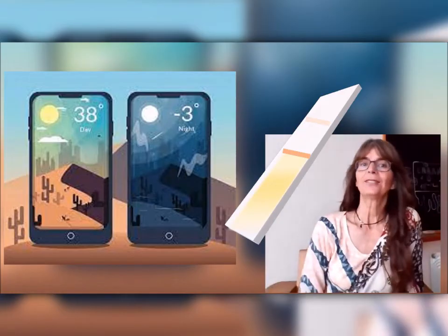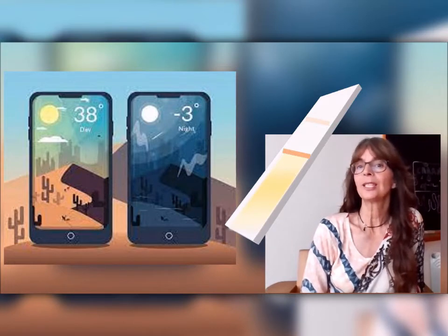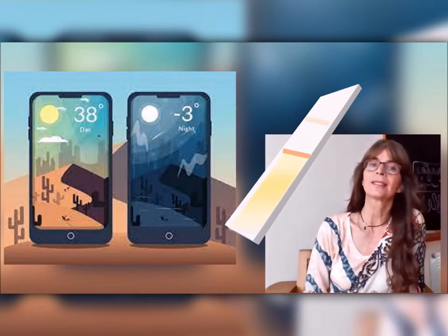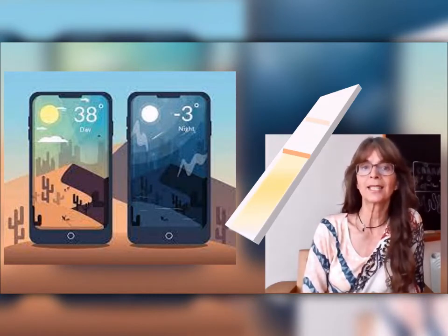The mobile telephone device is obviously the most practical, but it will be insufficient in many cases. For example, if we need to determine the level of concentration of a substance. Quantification is not reliable in this case due to many optical interferences. The paper can be stained or the ambient light varies a lot.